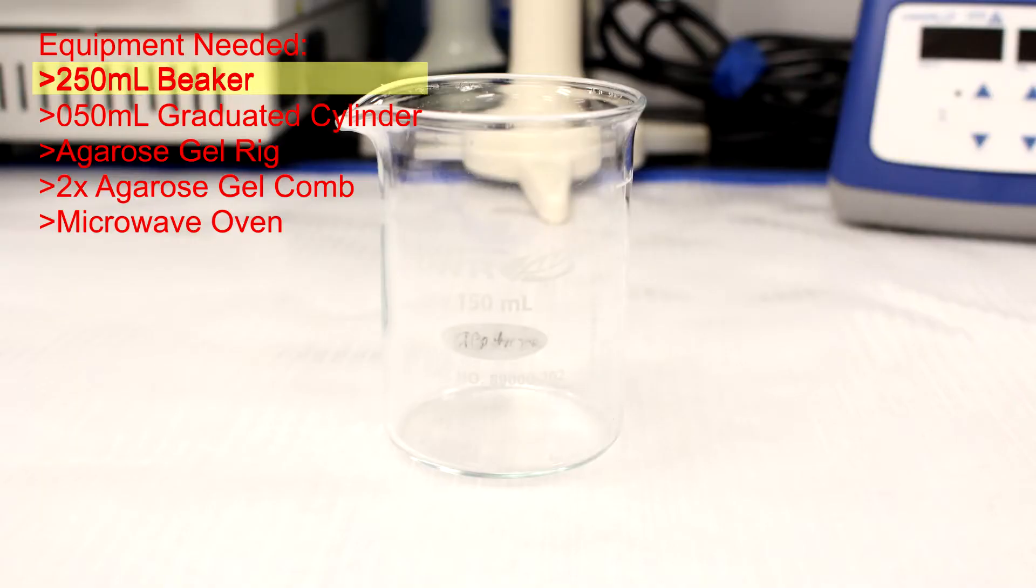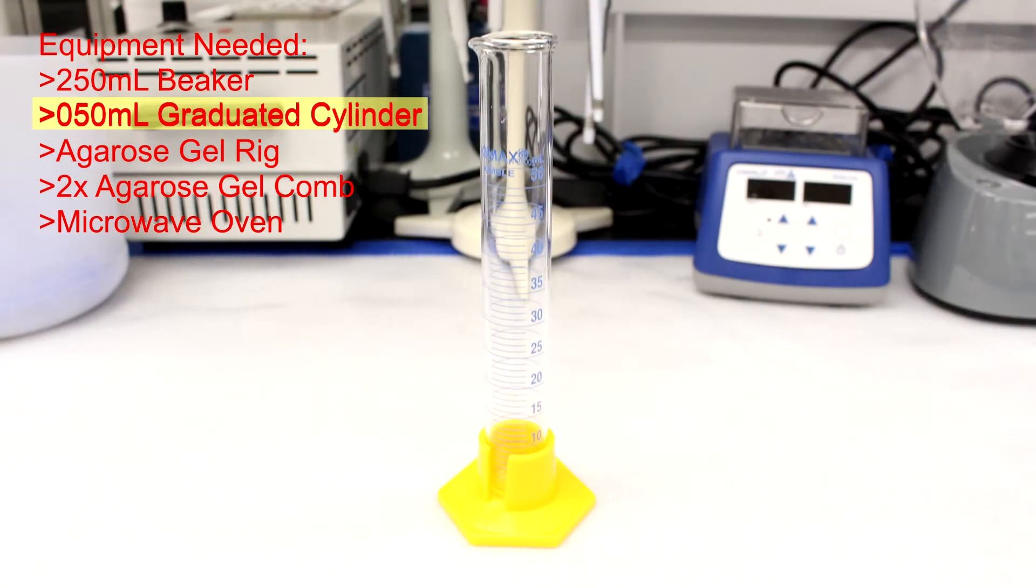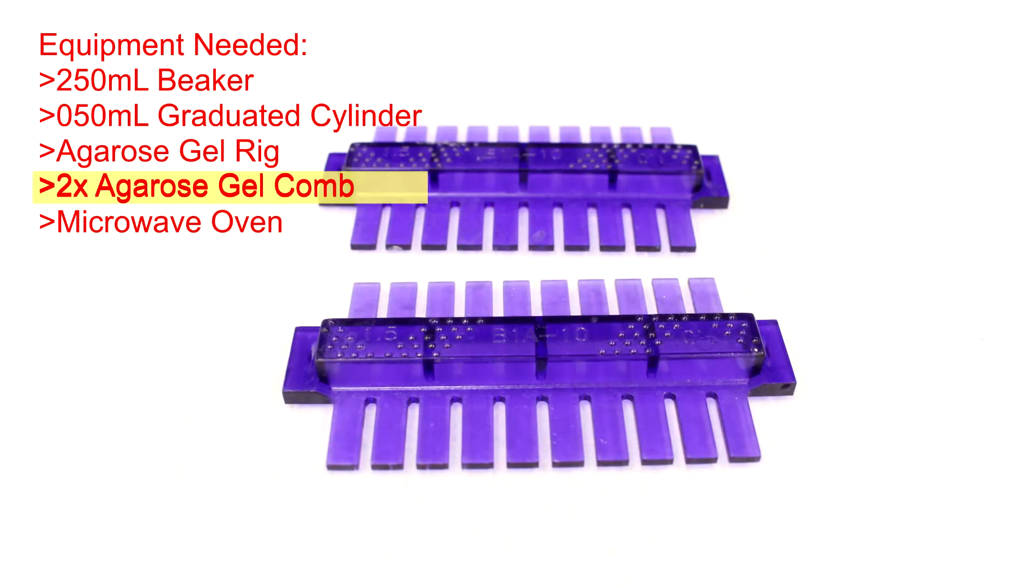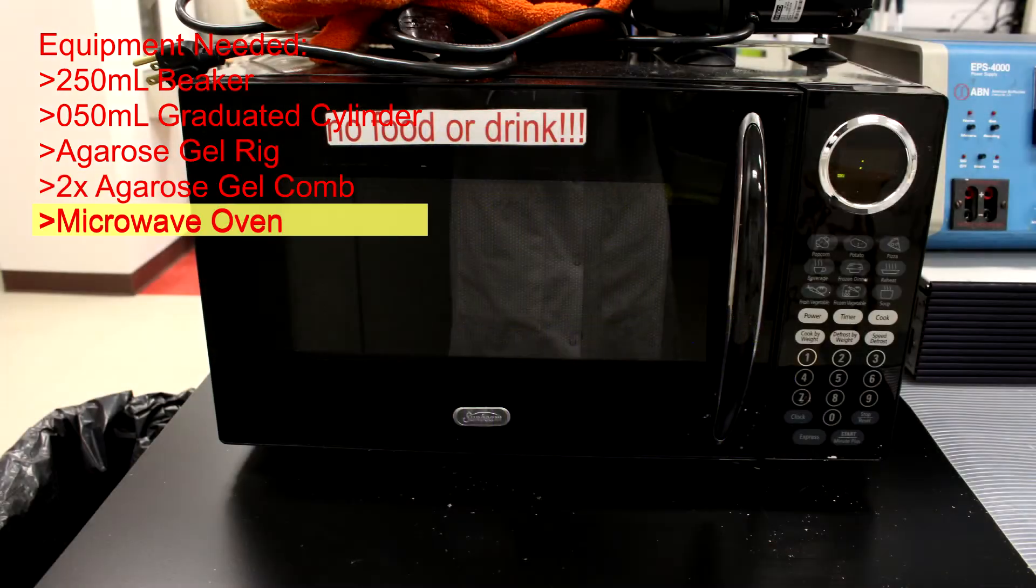The equipment required for this procedure are a 250 milliliter beaker, a 50 milliliter graduated cylinder, an agarose gel rig, 2 agarose gel combs, and a microwave oven.